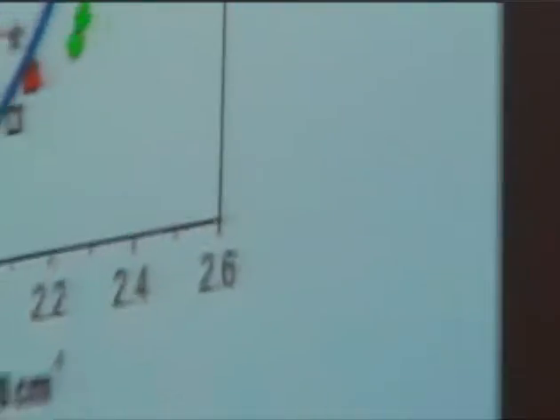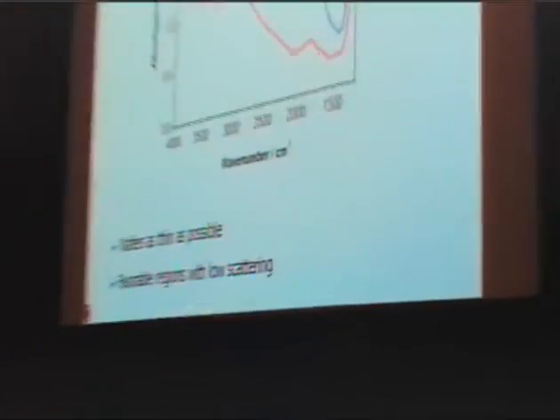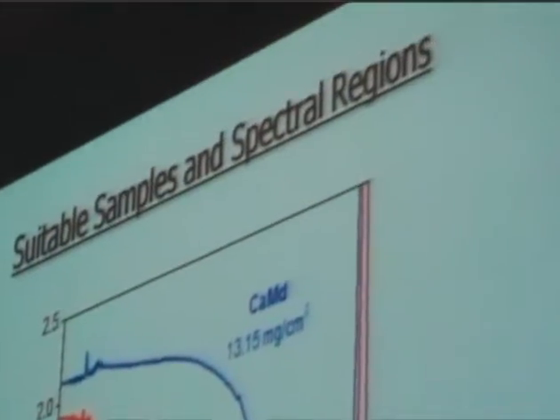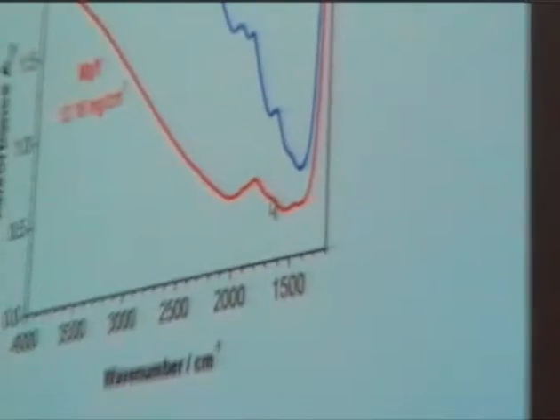Now, what's the way out here? Right now, the best thing seemed to be to circumvent this problem and actually just to select better samples that will not scatter that much. And so we moved from zeolites mordenite to zeolites Y. And we, of course, also see that there are better regions in the spectrum than the CH vibration region, for instance, down here, which is why we will return to the propene CC vibration later.